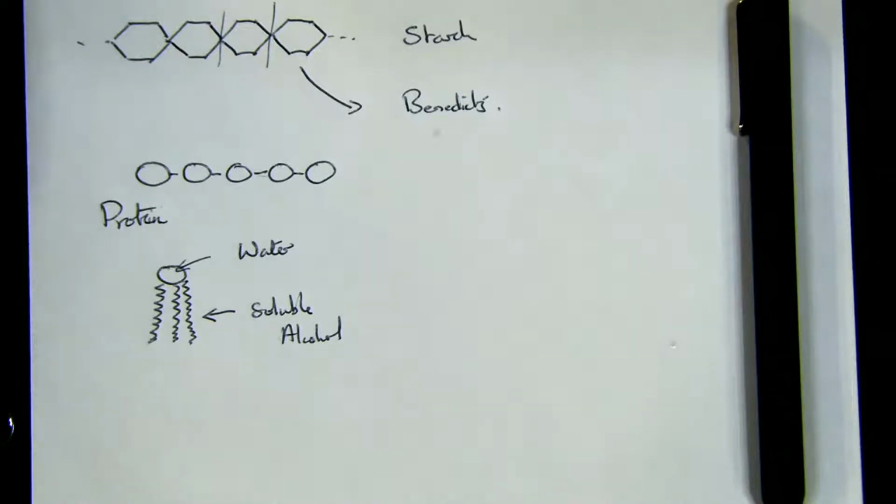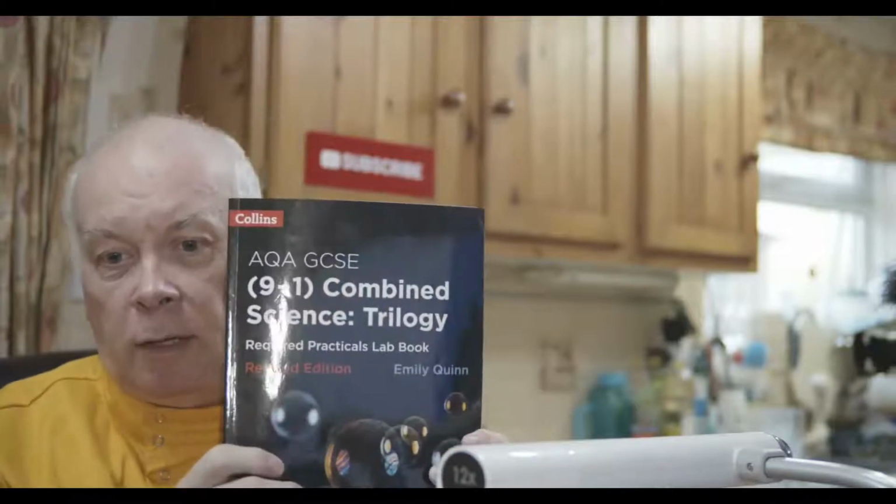Many people will find that they've got a special book to do this work with, and this is quite a popular one, this Practical Labs book, and many students get these and fill them in there. They're quite good, and I'm going to have a look at trying to create one of these tables so we can record what we're doing.